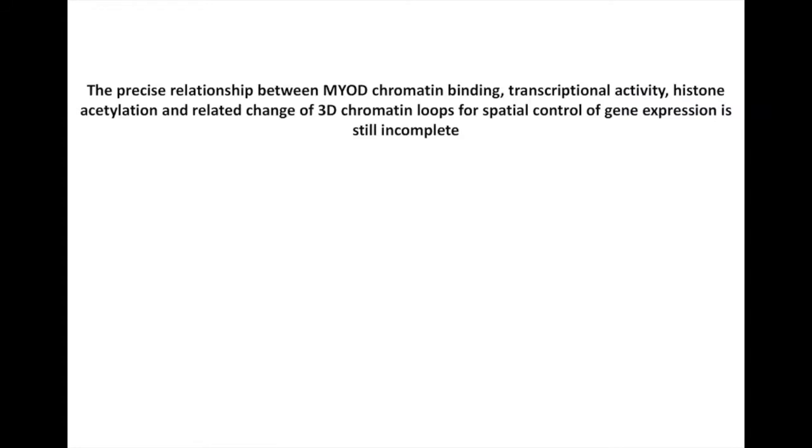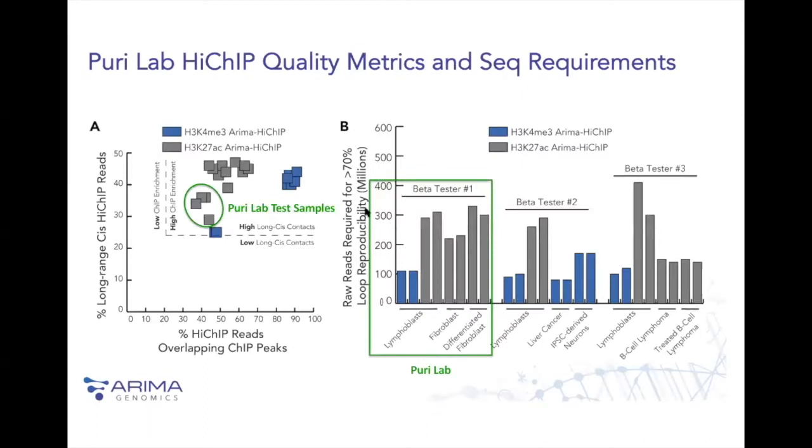Still, we realized that the precise relationship between the binding profile of MyoD, its transcriptional activity, histone acetylation, and the related change of chromatin three-dimensional loops was still incomplete, and we decided to address this with HiChIP using the Arima kit.